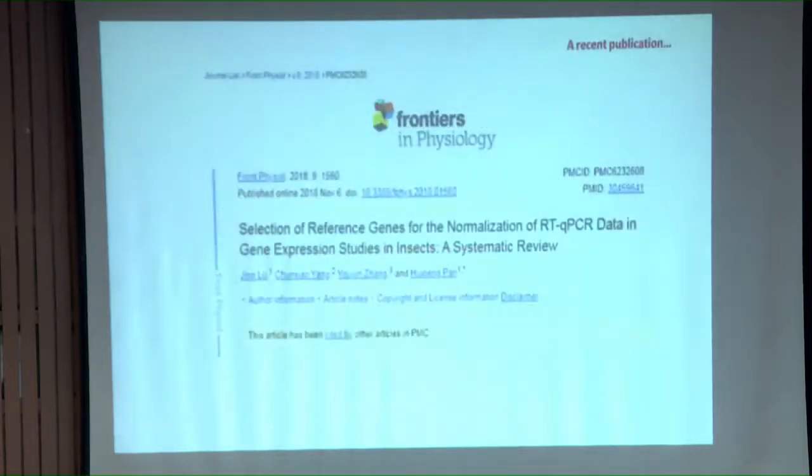So I'll take you to a small piece of information which I could update in my slides. Very often we encounter a problem: what should be the reference gene? Remember, a reference gene is one which is not affected by the conditions at all. I'll take a small example. If you have a plant which is infested by a sucking pest, a great deal of change happens in the host gene expression, and reference genes are selected from those genes that are not affected at all. Whatever the condition, their expression is constant. Keep this point in your mind. Those genes are taken on board as reference genes.